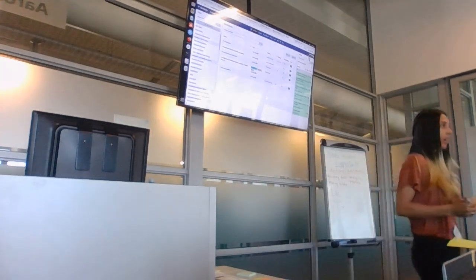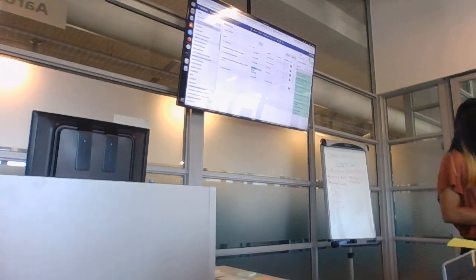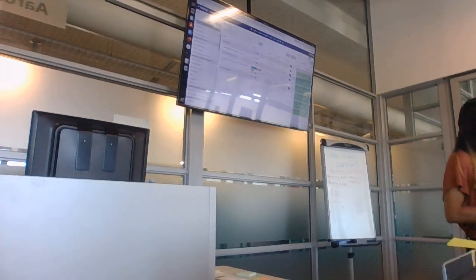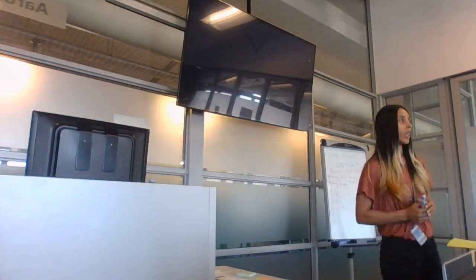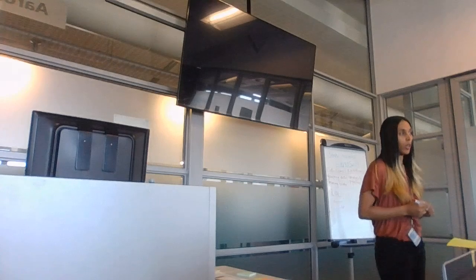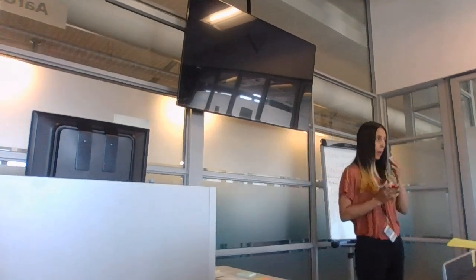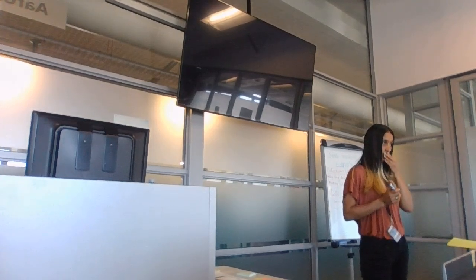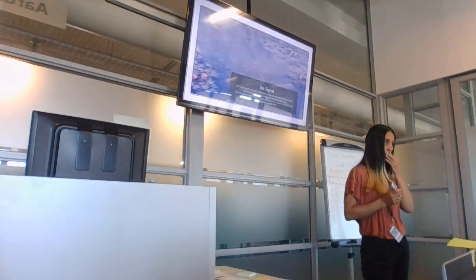So, hold on. When you have a reverse file and forward reads, they are not the same length. When you do trimming, they are considered the same length, right? No, they will never be the same length, because it depends on how you set your parameters. So when you are picking the reverse, which might be longer than the other one, for doing Kraken, would it really?